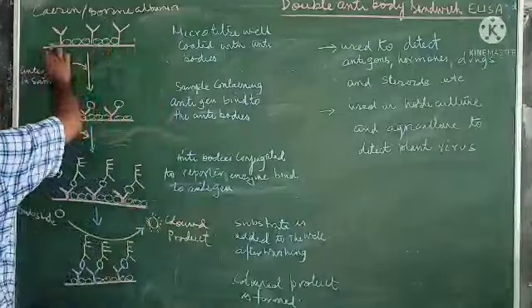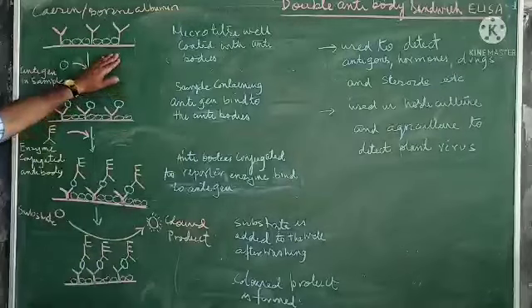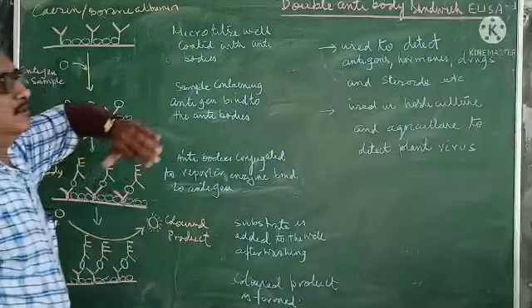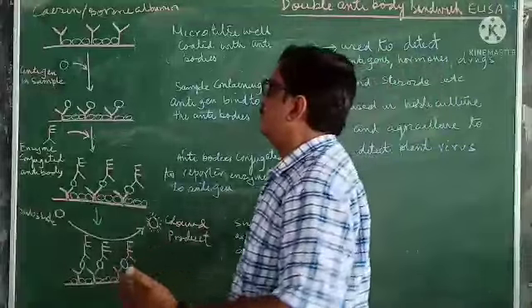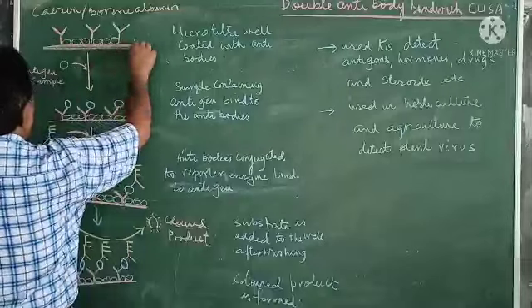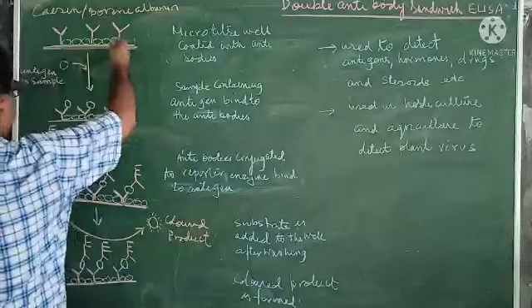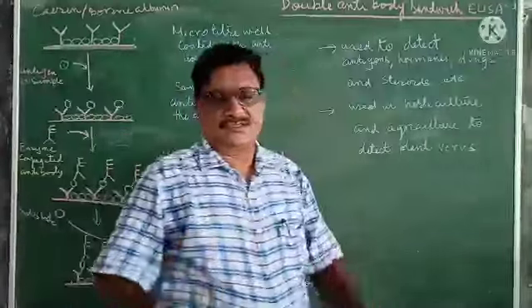Because these molecules bind to the exposed surface and cover it, they prevent the binding of any unrequired molecules or antigens present in the sample to it, which would otherwise hamper the process.